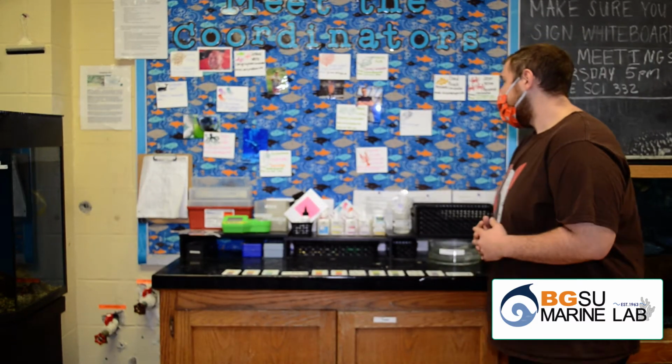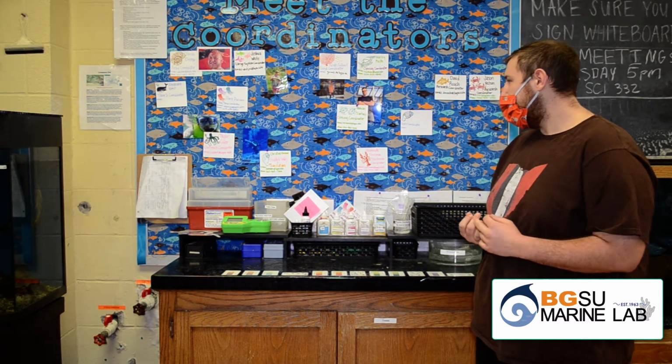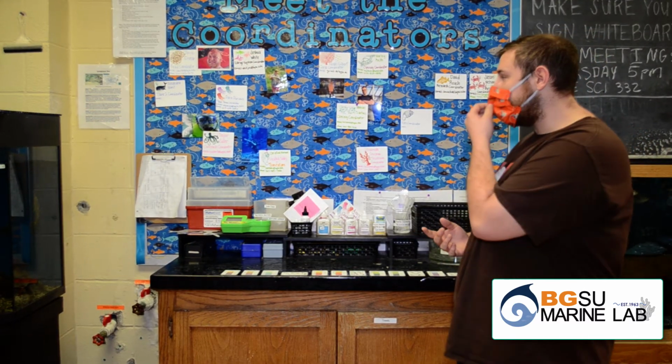My name is Joshua White. I'm a student here at Bowling Green State University. I am actually currently the large system coordinator here in the lab, and this is our coordinator board. So right here on this board you will find the name, the head of what they do, and then their email and phone number. So that is how you get in contact with them if you have a problem with your tank or any questions that you just want to ask.